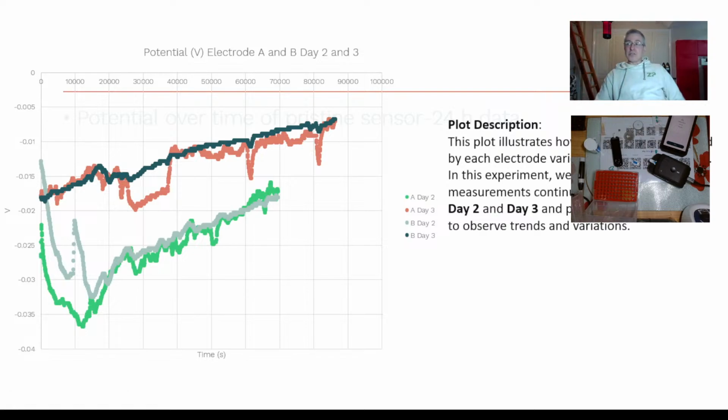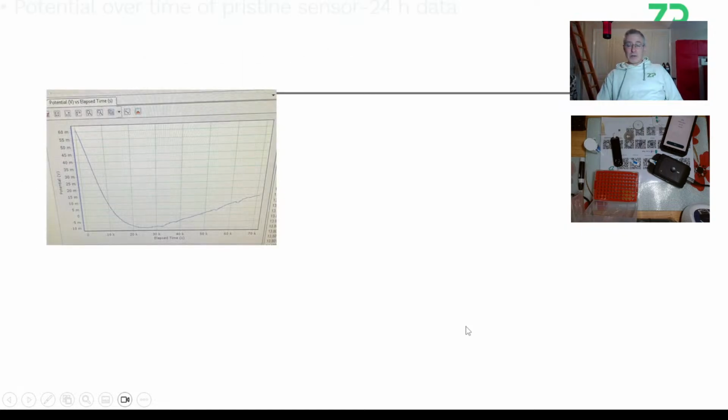It does allow me to answer your questions in more detail, including things like I can see that you got a 27 millivolt change over approximately 2 to 3 days. It's actually quite good. And if you say, well, no, I need it to be more stable than that, well, think how long people have been making pH sensors and pH meters, and there's still calibration solutions next to them. OCP is sensitive to drift. No matter whether you're using screen printed electrodes or glass electrodes from Mettler Toledo, for example, they drift.